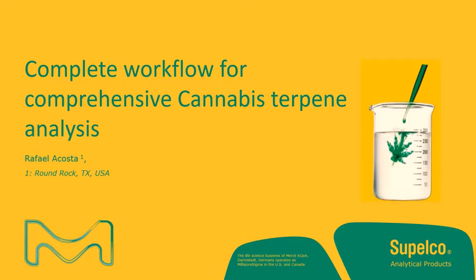In this talk, I will be sharing some tips and tricks for setting GC-MS instrument parameters for terpenes and cannabis analysis. I hope that you find this information informative and that with these tips and tricks, you continue to advance your laboratory productivity by reducing unnecessary downtime.